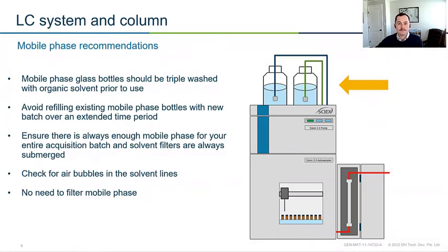The next thing that I always recommend doing is purging your instrument when you get in the morning. When you're building your batch, it's an easy thing to do. And this just ensures that there are no bubbles that have been left behind when it was sitting overnight. It only takes a few minutes and just gives you the best data quality you can.